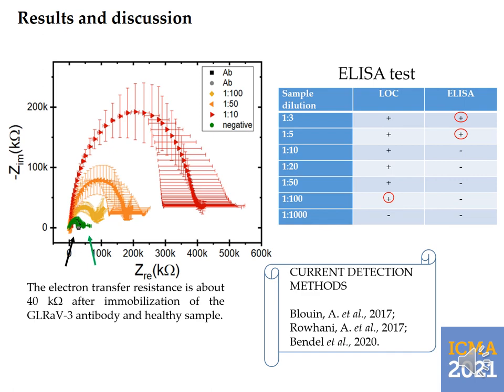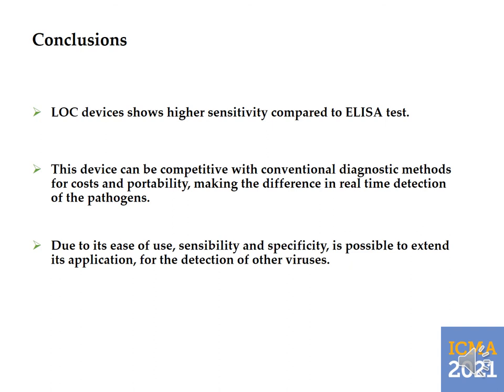In conclusion, we want to say that LOC devices show higher sensitivity compared to ELISA tests. This device can be competitive with conventional diagnostic methods for cost and portability, making the difference in real-time detection of pathogens. Due to its ease of use, sensitivity and specificity, it's possible to extend its application for the detection of other viruses.